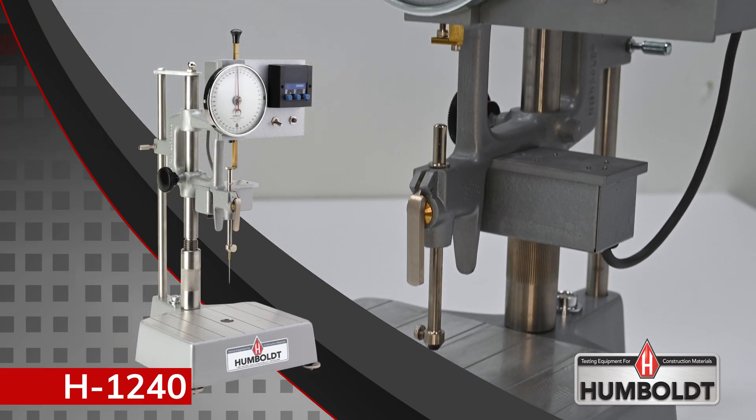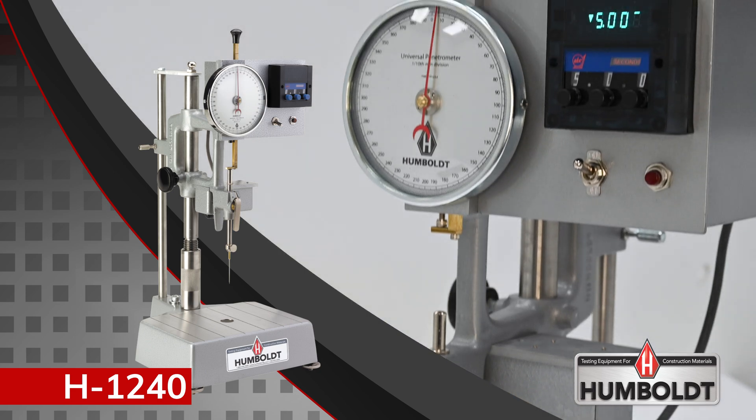So if you are in need of an accurate and dependable penetrometer for your lab, look no further than Humboldt.